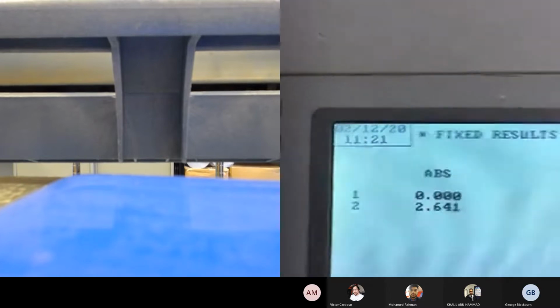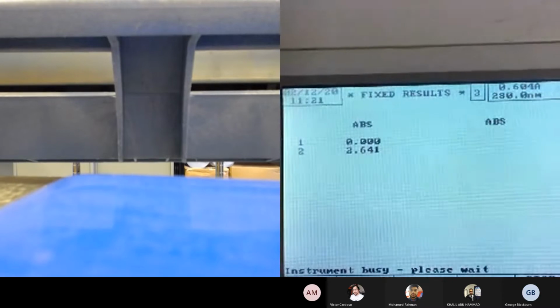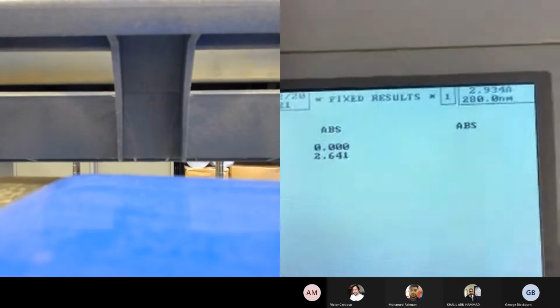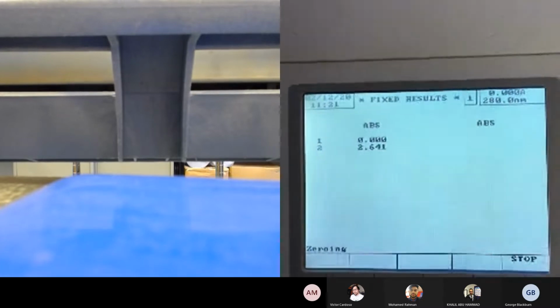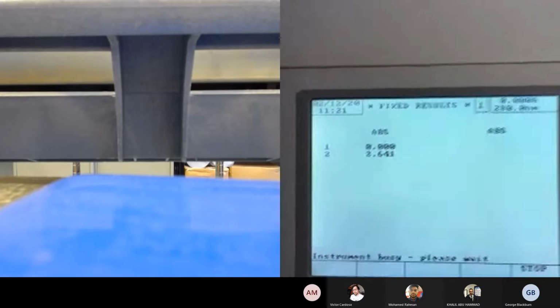Okay, so these have all been diluted by 11, not the whole sample, just an aliquot of it, so you can make the absorption measurements. And these should hopefully come in within range of the Beer law now, which is less than 1.2, or I think 1.4 maximum really, but preferably below 1.2.